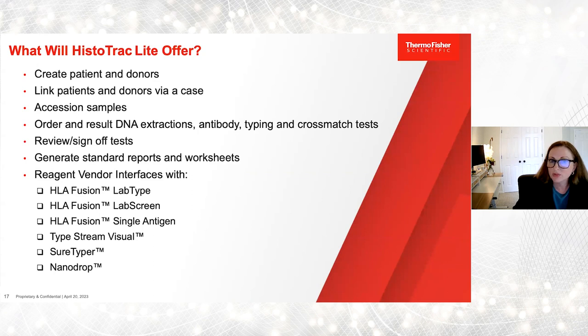It still will offer you the ability to create patients and link them, accession samples, order your antibody typing, crossmatch, and extraction test, review and sign them off, generate the reports, and then it would have interfaces to LABType, LABScreen single antigen, TypeStream Visual, SureTyper, and NanoDrop.